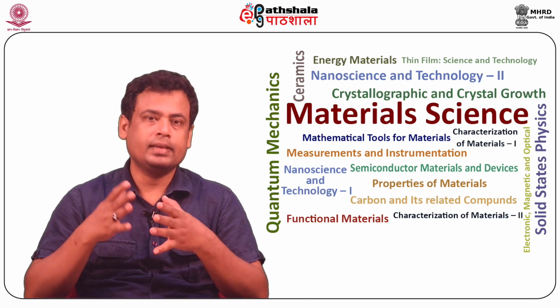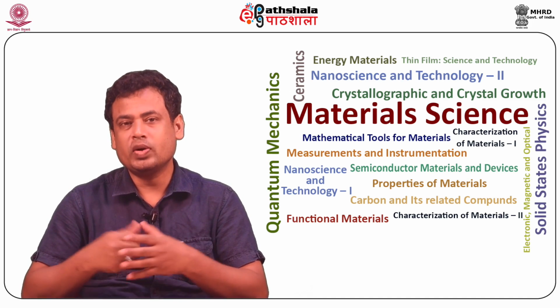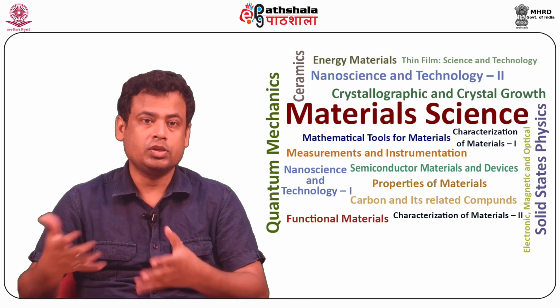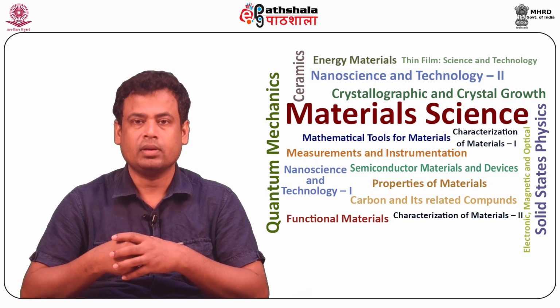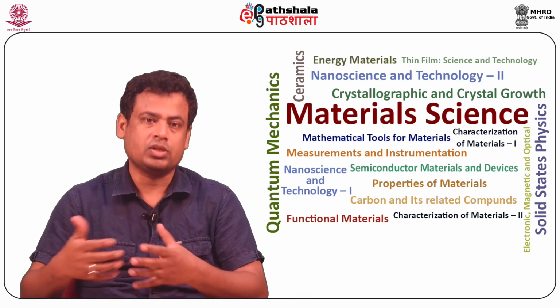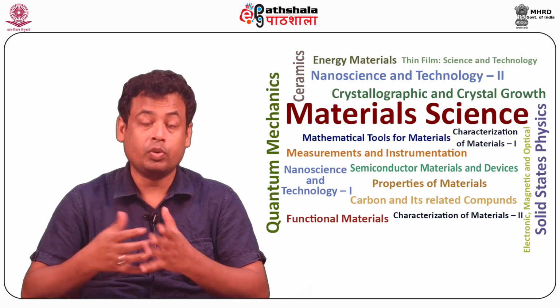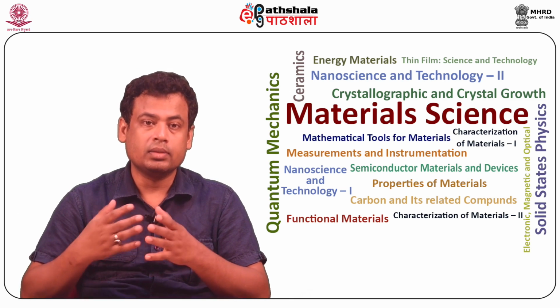Let us see what are the advantages of low voltage SEM. In low voltage SEM, where V is around 1 kilovolt, the electrons impinging on the specimen's surface with low energy penetrate a shorter distance through the surface, possess a larger cross section and produce secondary electrons near the surface where they can escape.